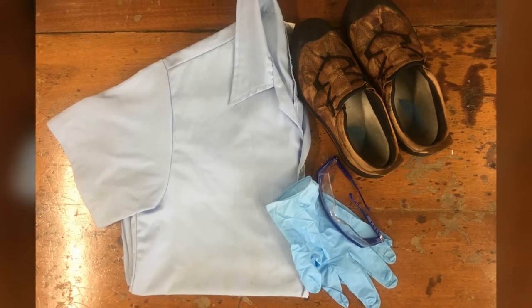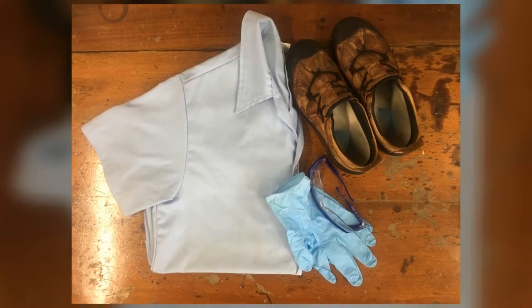Remember safety gear when working in the lab: lab coat, safety shoes, gloves, and of course our lab glasses.